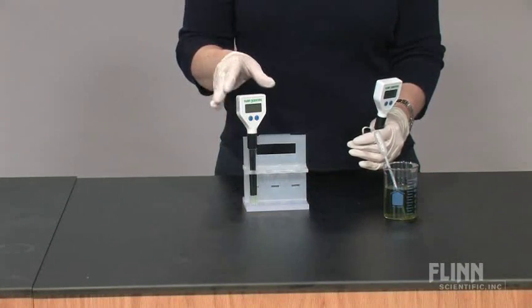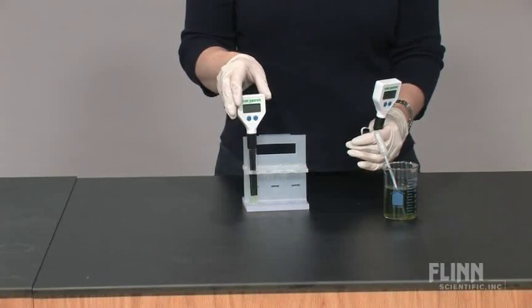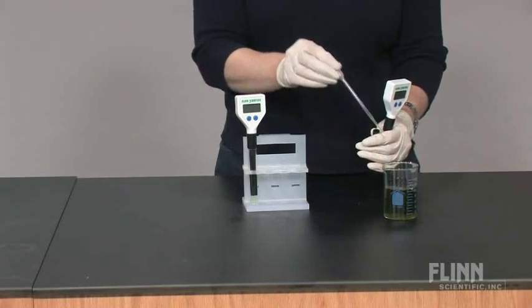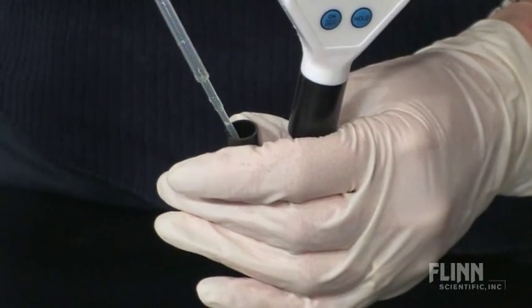For long-term storage, the pH electrode should be stored upright and in a storage solution. The storage solution can be placed in a test tube as we saw earlier or in the electrode cap.